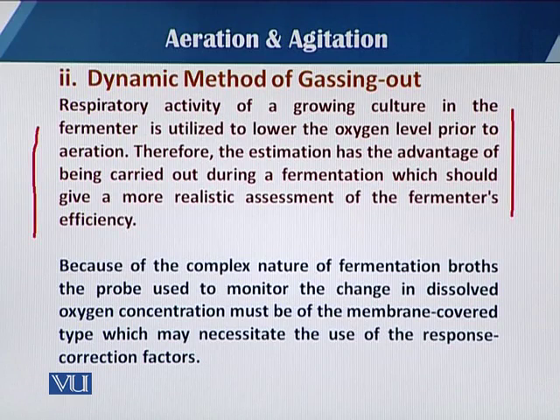The estimation in that case is basically a realistic assessment of the fermentation activity, because the oxygen present in the dissolved form is completely utilized. When there is a maximum decrease in the dissolved oxygen, then we start aeration, and then we can find the change in the oxygen transfer rate.